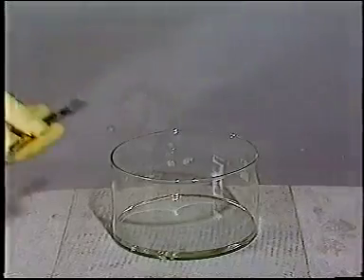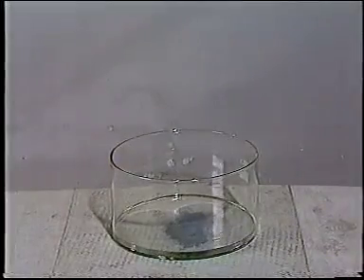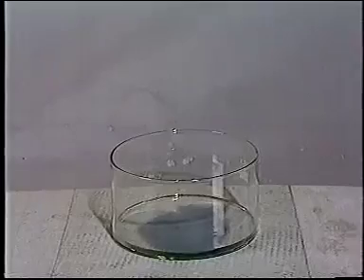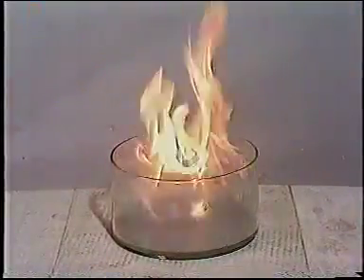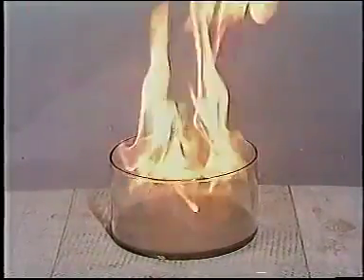Here's a reaction you'll meet later in the course. If lithium aluminium hydride is added to ethyl ethanoate, a vigorous reaction takes place, giving off sufficient heat to ignite the ethyl ethanoate and the product of the reaction, ethanol.